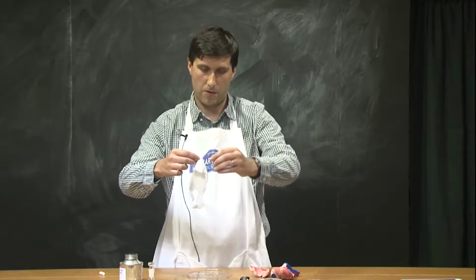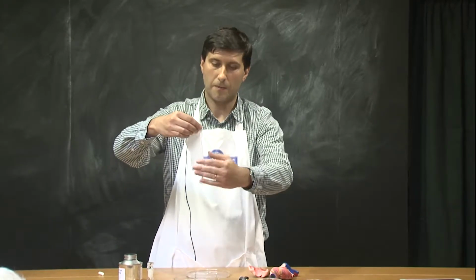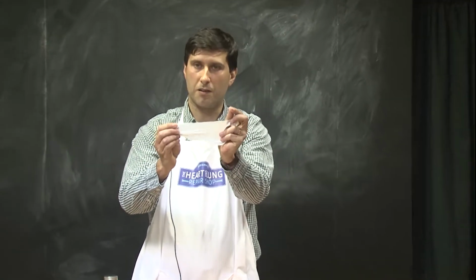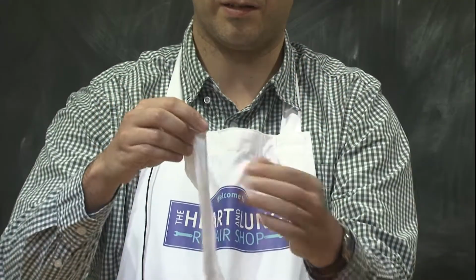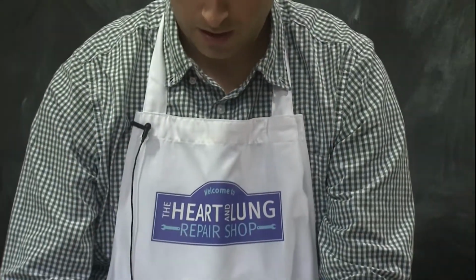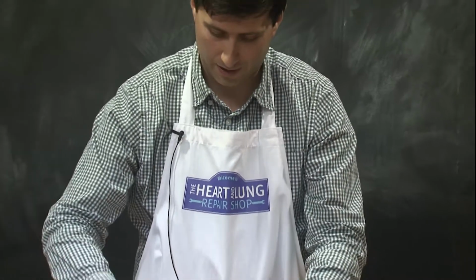This is how it looks. You can have a look at it if you want. You can touch it, it's not harmful. This material is fairly strong if you pull it a little bit. And this is the scaffold, the basis for our future tissue, our future valves.